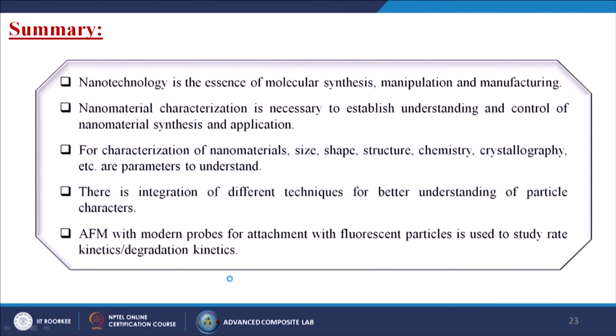For characterization of nanomaterials, size, shape, structure, chemistry, crystallography, etc. are the parameters to understand. There is integration of different techniques for better understanding of the particle characters. AFM with modern probes for attachment with fluorescent particles is used to study rate kinetics and degradation kinetics.